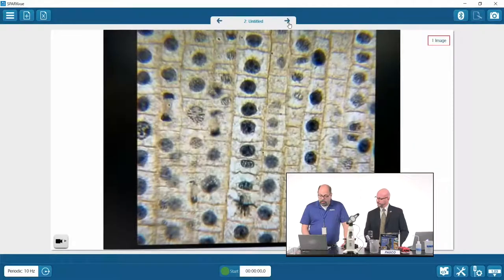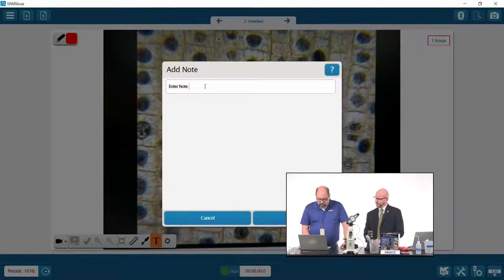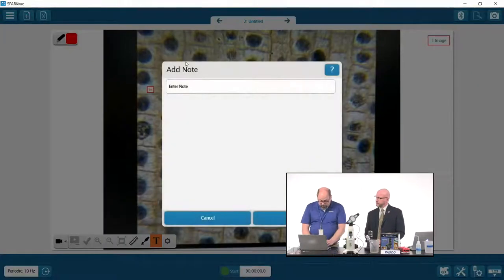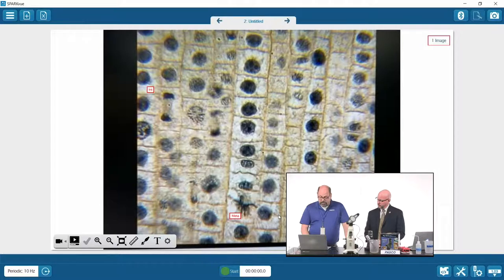Right. And so if we jump over, obviously, if we take some quick shots of some cells in this sort of range, we have slides that have some measurements in here that we can show, and we can use these slides not only for measurement, which we'll get to in the second part of the slides, but I can also annotate some of these if I want to put in information about each of these cells, if I want my students to know that, if I'm looking at different phases, I can put something like interphase for some cell like that. Or if I want to say, oh, this looks more like metaphase or some second look. And we can label all of these going down through and use that to categorize what stage of division these are in.